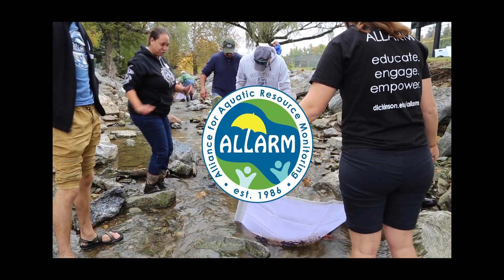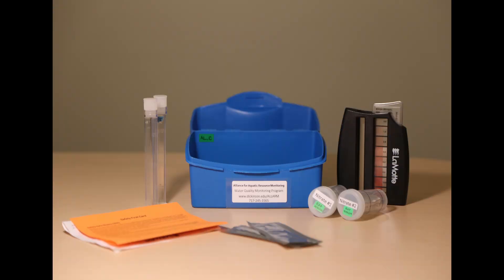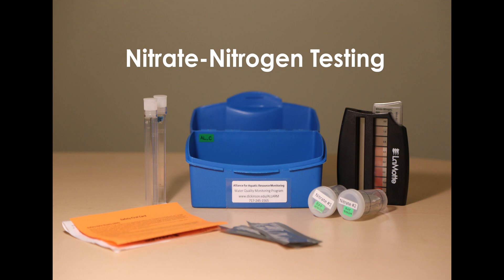Using water quality data, communities are able to learn more about the health of local streams. In today's video, we will be teaching you how to conduct a nitrate-nitrogen test on your water sample.